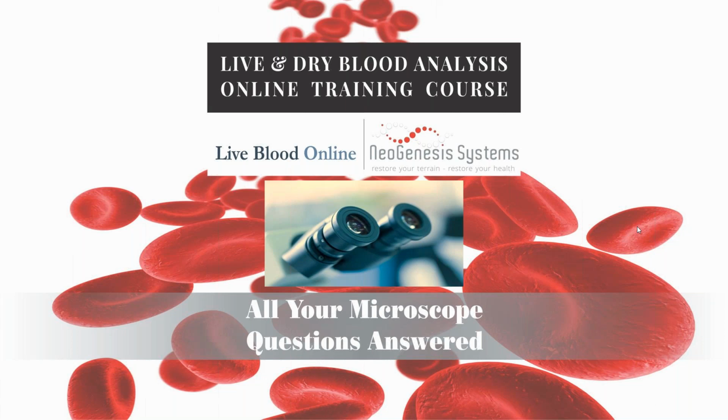Thank you. And another question. Why do we recommend these 4 microscopes and not any other dark field microscopes that are available online? All right. So that again relates to the specifications that we are going to be looking at. So we'll go through those in detail during the slides as well.